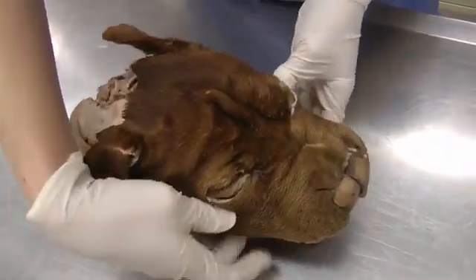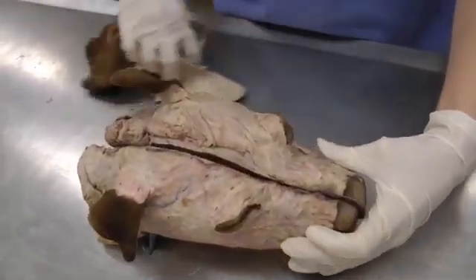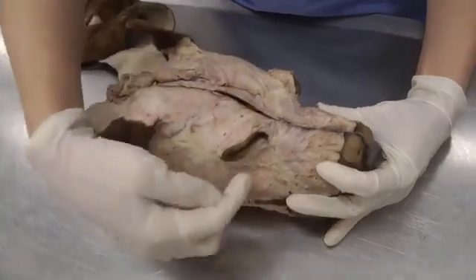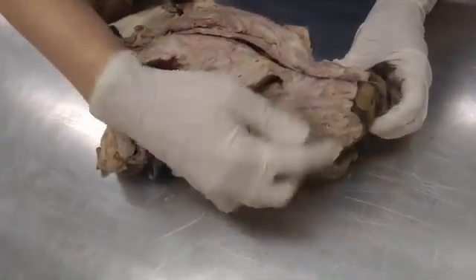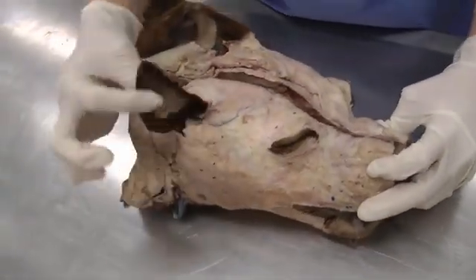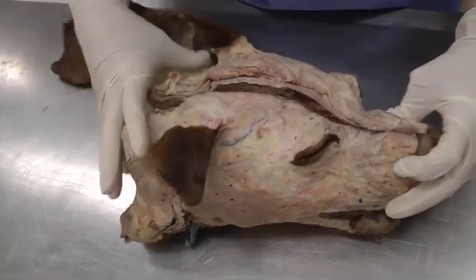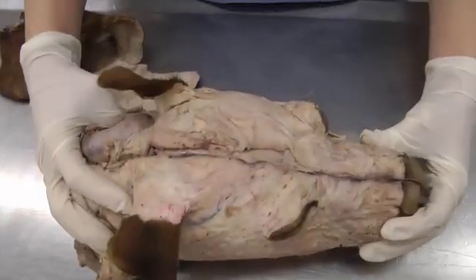You will skin the head — take the skin off the whole head. Remove all the skin, just leaving a margin around the eyes, around the nose, around the lips, and at the base of the ears. You can leave the pinna — you don't have to skin that, just skin the base of the ear. The rest comes off, but leave those little margins.